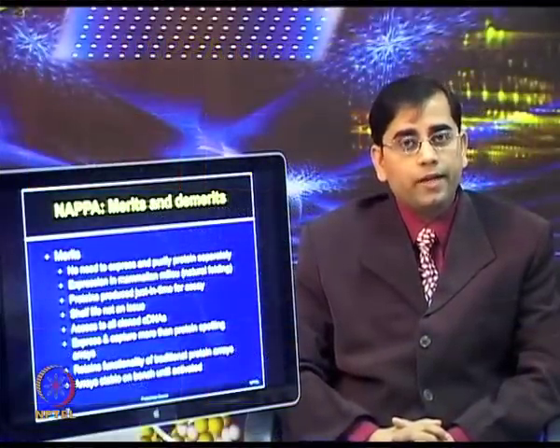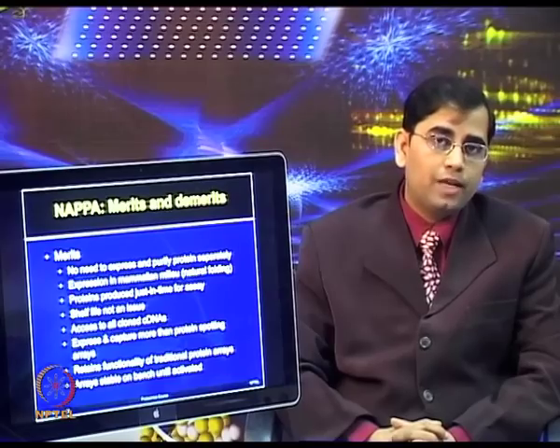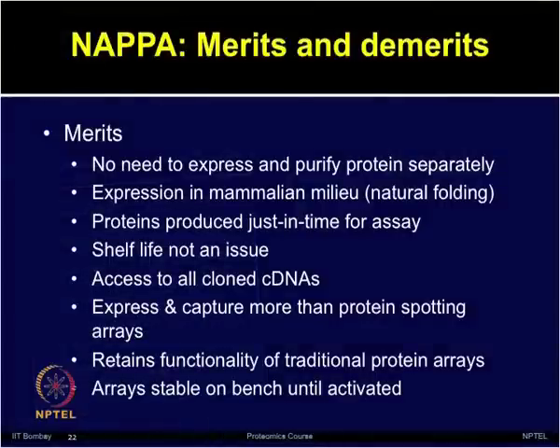There is no need to express and purify the proteins separately, because one can use the in vitro transcription and translation system. The expression is performed in a mammalian environment by using rabbit reticulocyte lysate, which helps in the natural folding of mammalian proteins. Proteins can be produced just at the time when you want to perform an assay, because cDNAs are quite stable to store at room temperature. Therefore, shelf life is not an issue in this case.